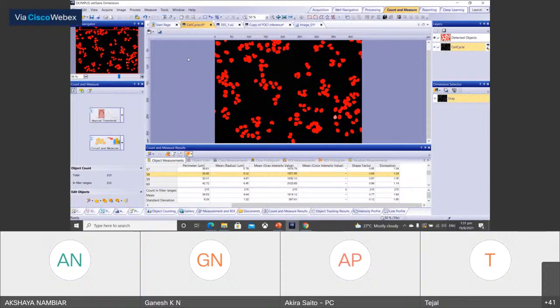But I can show how it works, how you set the training, the ground truth, give the training to the neural network creation, and how to do the inference.